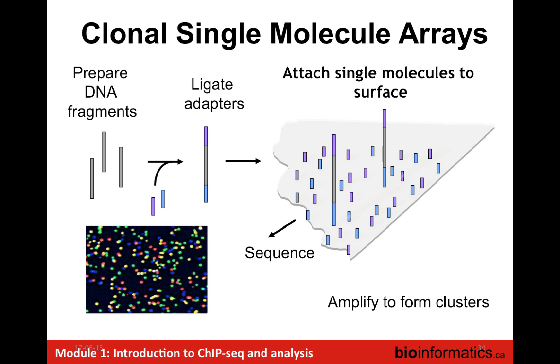And so it's done using something called emulsion, where we add a lot of water, or we add our PCR brew, our beads, and a lot of oil, and we partition each of the beads and our DNA using an emulsion. The problem with that, of course, is that we're using a Poisson distribution to actually get a single bead and a single piece of DNA in a well, and of course we get a distribution. Many wells have two, three, four, some. Many wells are empty. So that's why that technology was really difficult to apply en masse, because we needed a lot more material to actually get it to move forward. So one of the reasons why arguably Illumina sequencing has predominated in the market, or at least in the research realm.